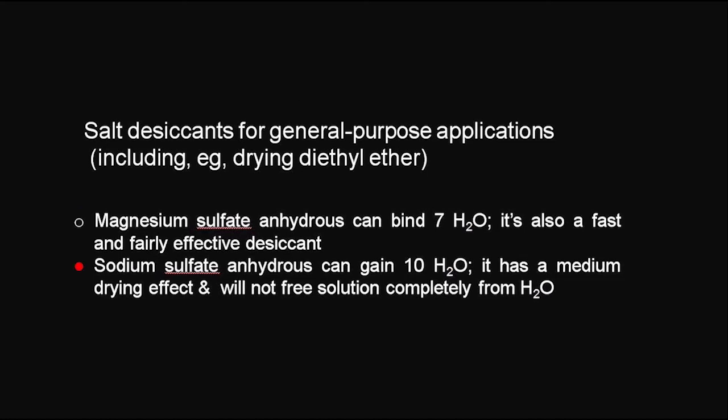As for sodium sulfate, it works well for both solvents.